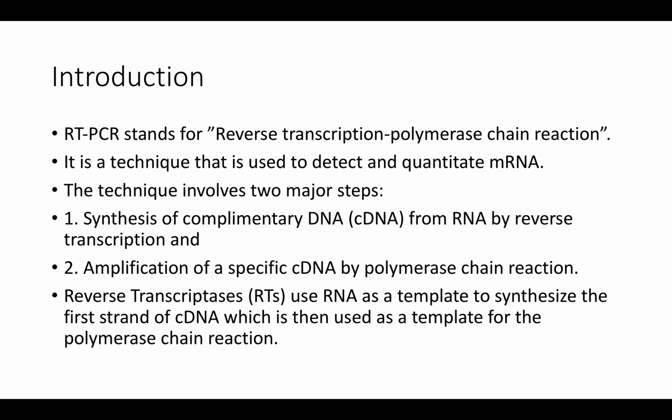RT-PCR stands for Reverse Transcription Polymerase Chain Reaction. It is a technique that is used to detect and quantitate mRNA. The technique involves two major steps. Step number one is the synthesis of complementary DNA from RNA by reverse transcription, and two, amplification of a specific cDNA by polymerase chain reaction. Reverse transcriptases, or RTs, use RNA as a template to synthesize the first strand of cDNA, which is then used as a template for the polymerase chain reaction.